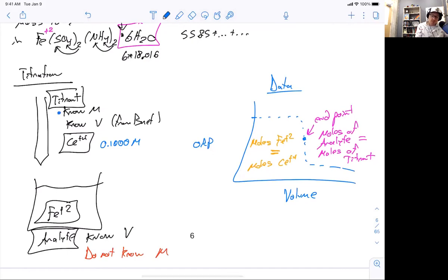So you know the molarity, and we will also know the volume that you add, because the burette is really good at reading volumes. Down here is 50, up here at the top is 0. So you always want to start with it full and reading 0. And then if, say, you drain down to 10.11 milliliters, that's how much of the cerium you've added to the beaker. So that's how you know the volume that you've added at any point in time.